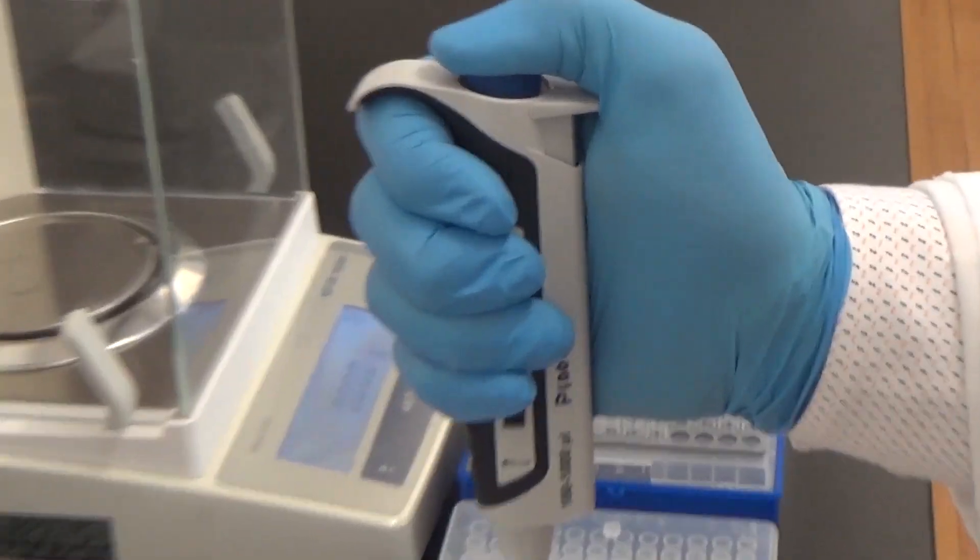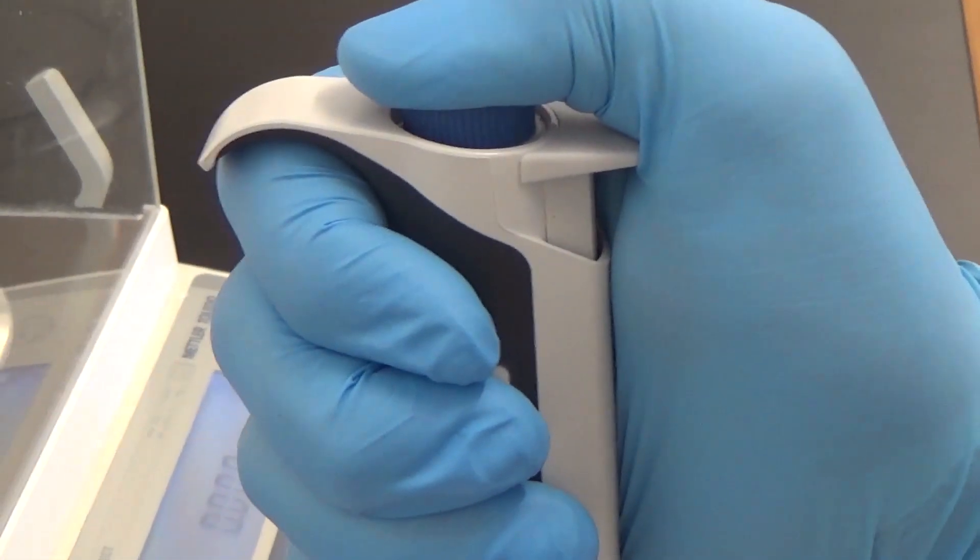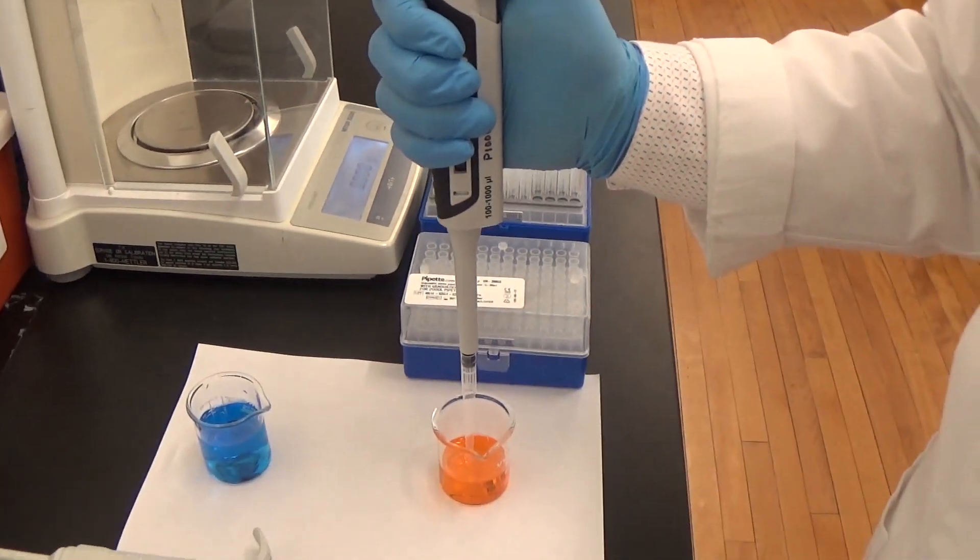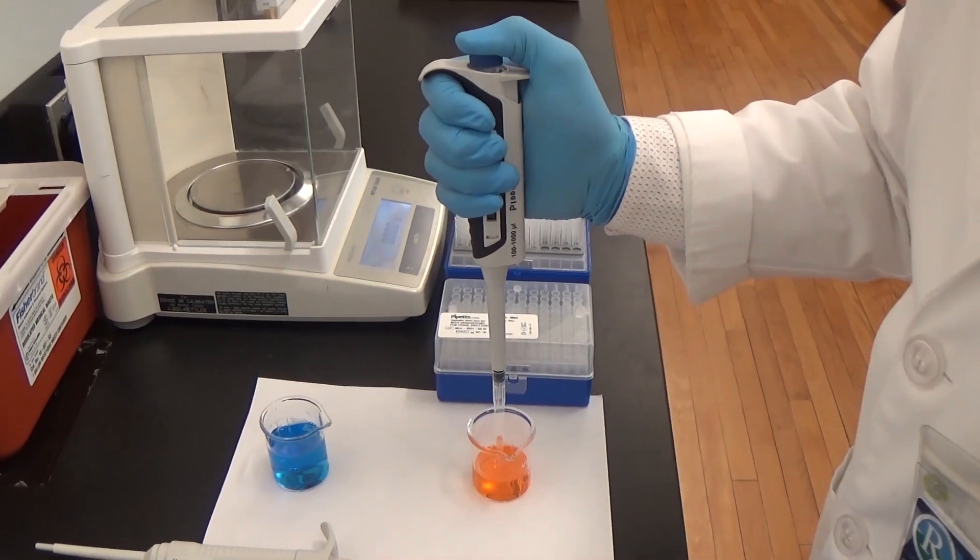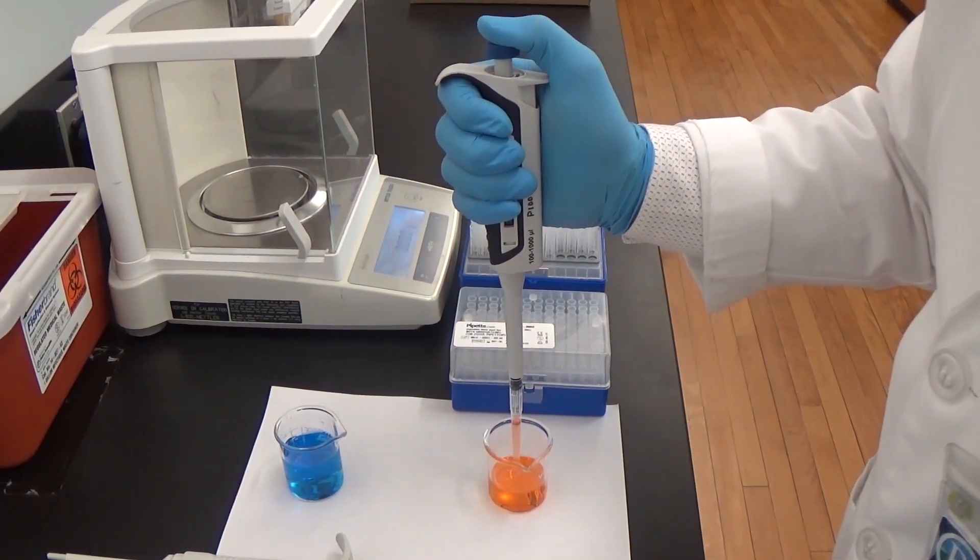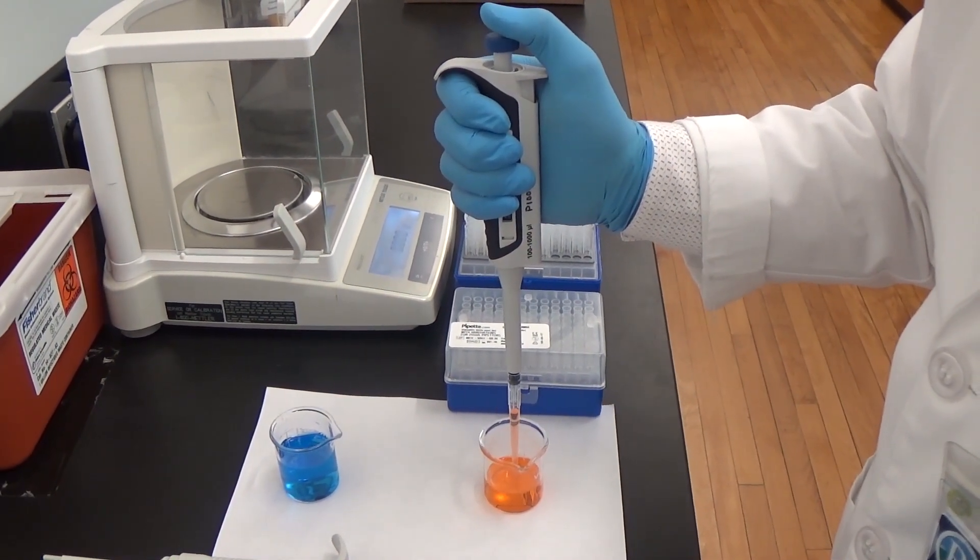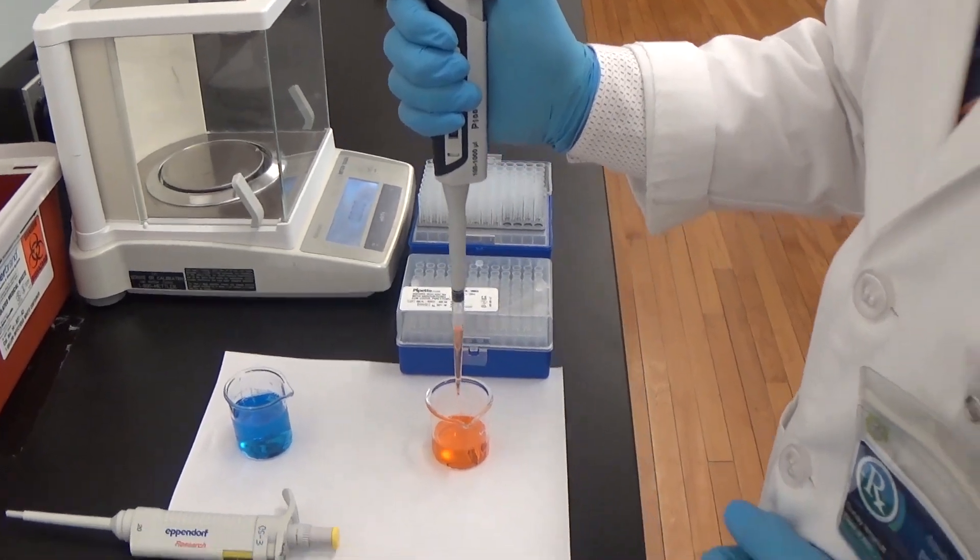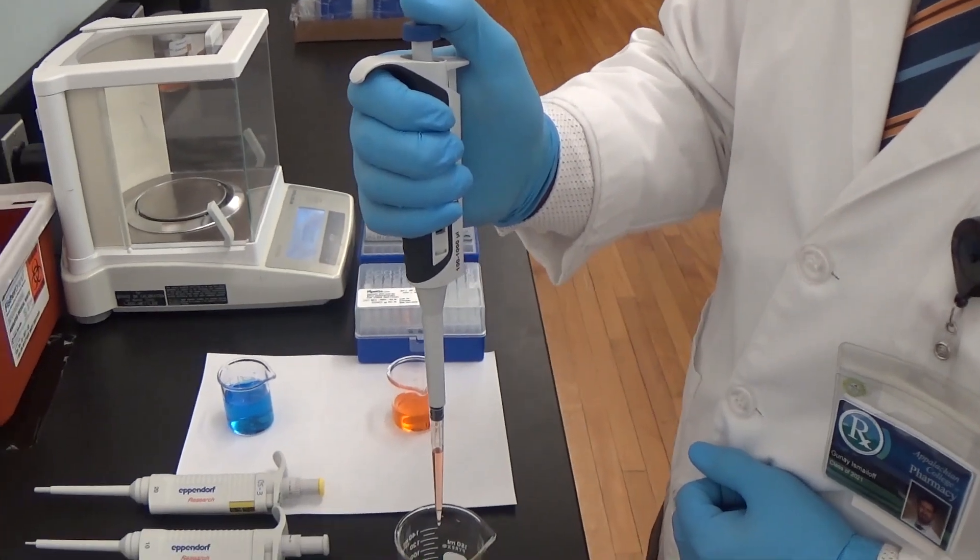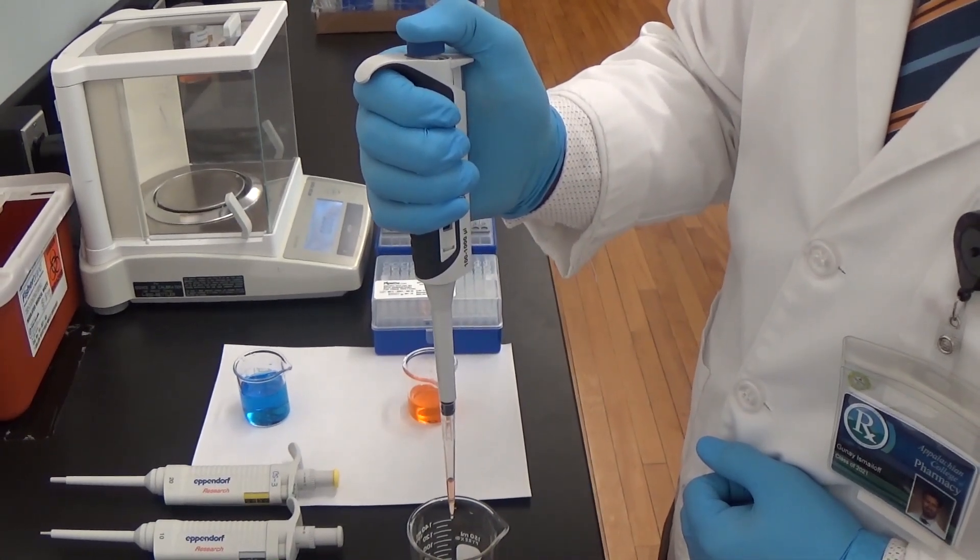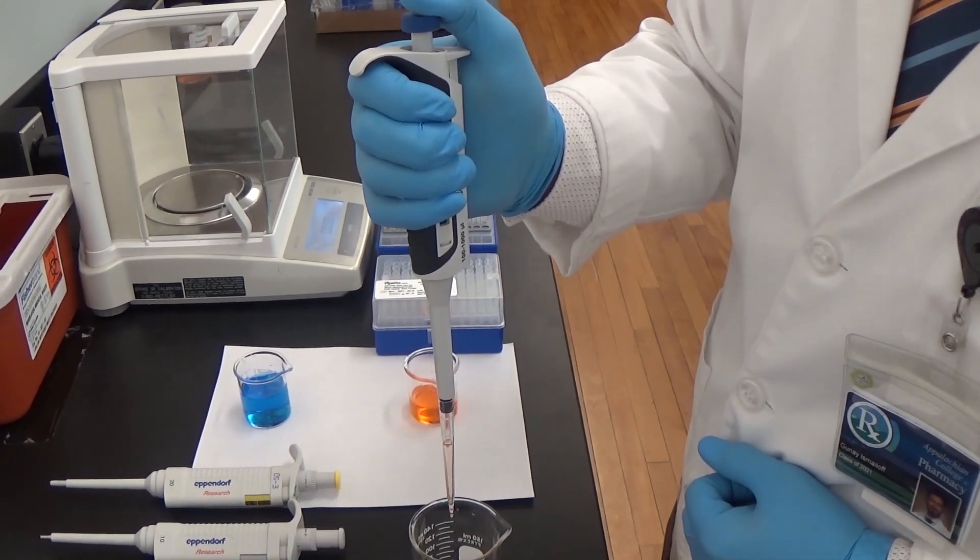In the case of using reverse pipetting method, to draw liquid you must depress the plunger to the second stop because the liquid is very viscous. Dispense the liquid by gently pressing the plunger to the first stop. This volume is equal to the set volume.